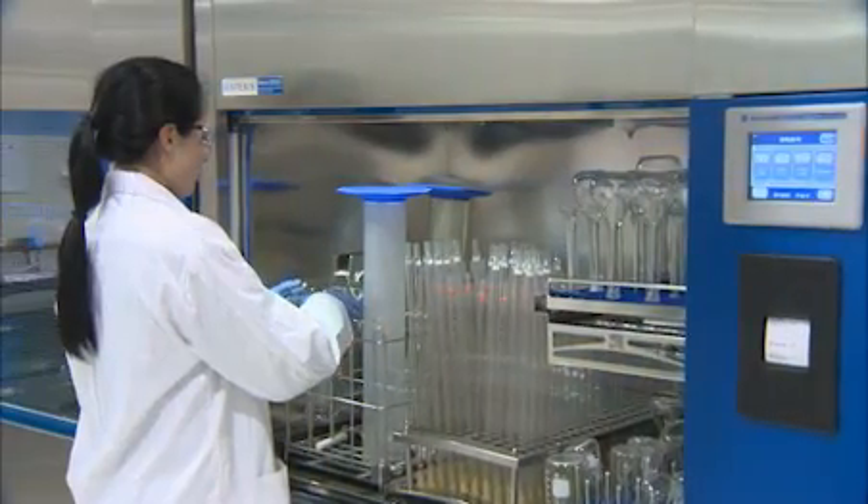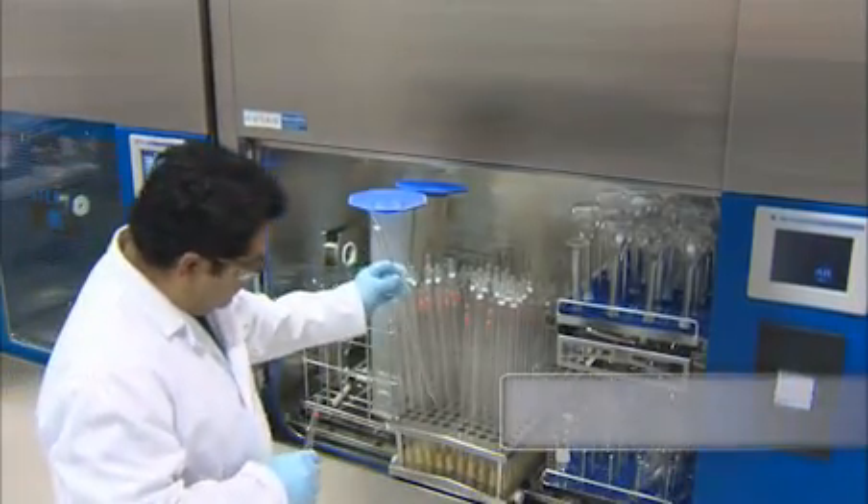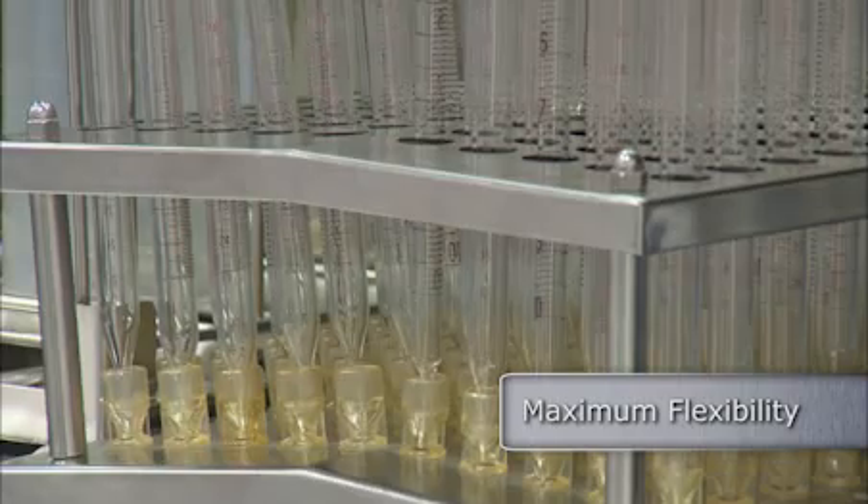Additionally, an extensive line of loading accessories can accommodate a wide range of glassware simultaneously, optimizing productivity and turnaround time.